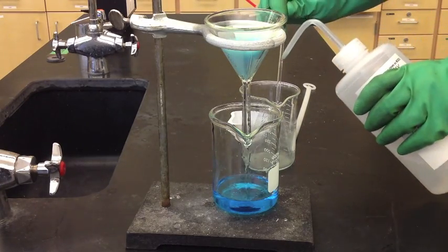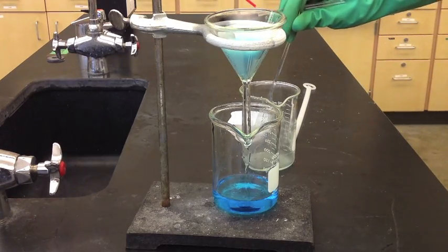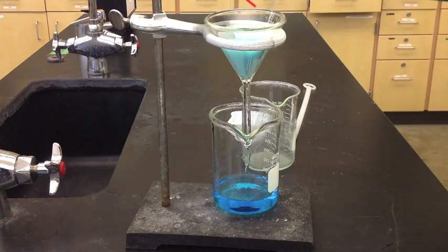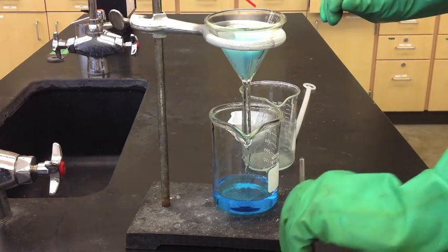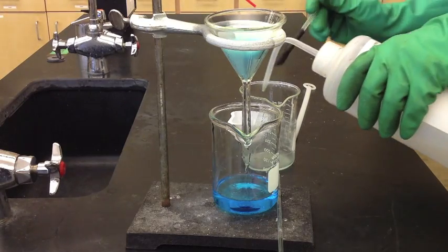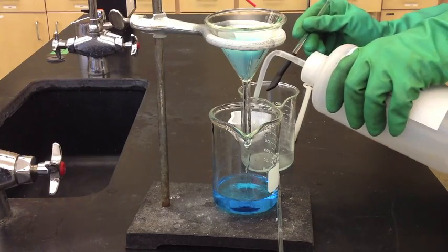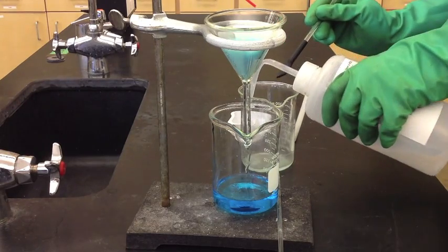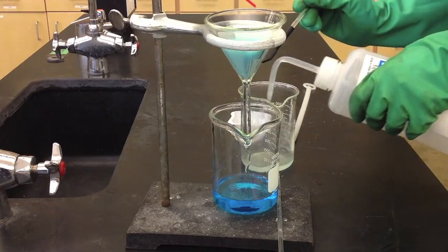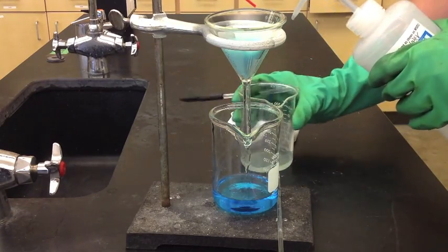Rinse the glass stir rod — that's just to remove any residue off of it. There are a few little chunks on the side; you can use the rubber policeman to help pull those off. Most of it is just washing it around and rinsing it down to the bottom.